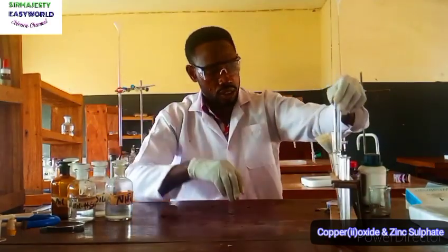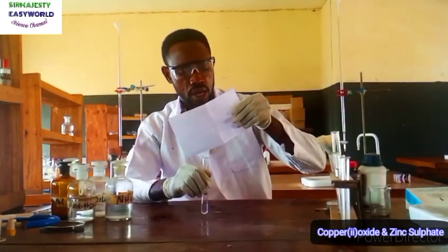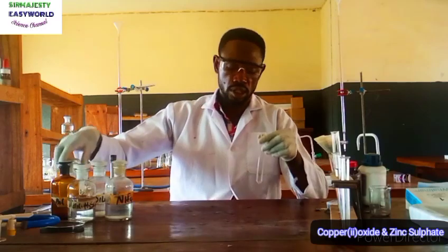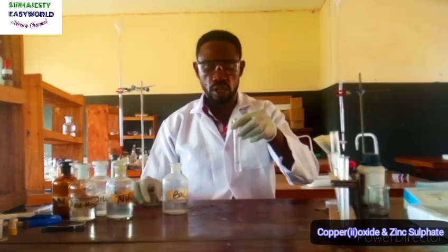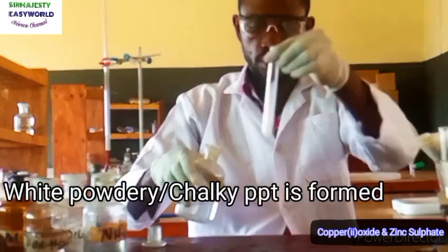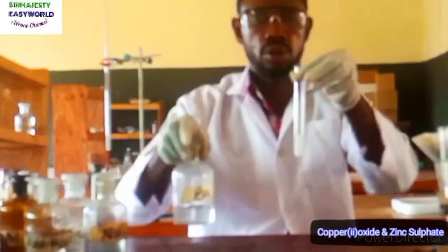So we now go to the next one, the third portion. Our question guide says that we should add aqueous barium chloride to the third portion, followed by dilute HCl. So this is aqueous barium chloride. Here they are not talking about in drops or in excess, just add. So let's add. Okay, see, there is formation of a white powdery precipitate with barium chloride.